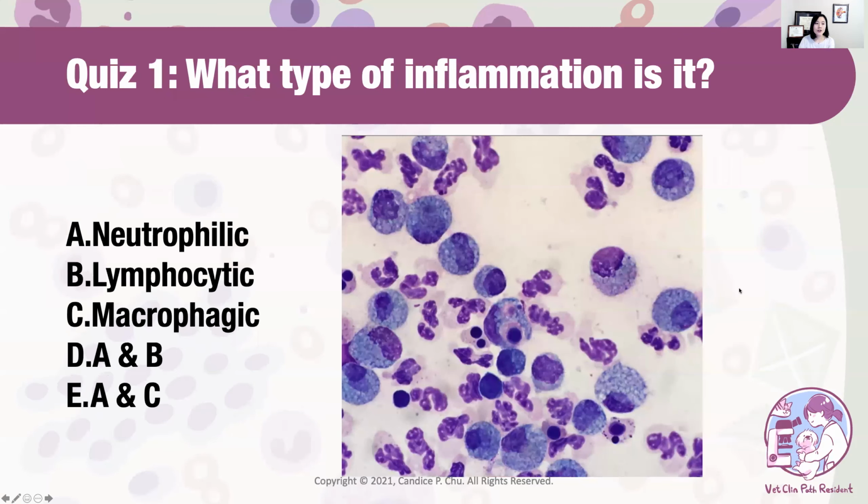All right, so here comes the first quiz. What type of inflammation is this one? And I want you to choose the best answer. Describe everything that's happening in this picture.